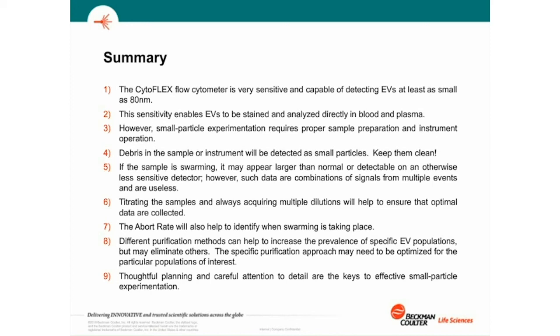Different purification methods can increase the prevalence of specific EV populations. However, they can eliminate others. So it is important to tailor your purification approach to the population of interest. Ultimately, thoughtful planning and careful attention to detail are the keys to effective small particle experimentation.